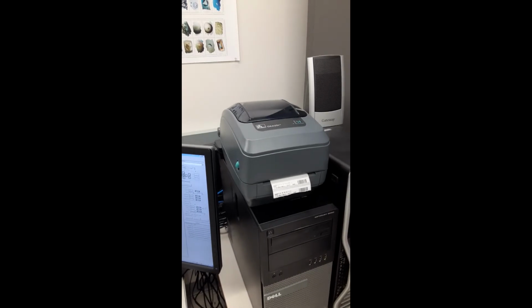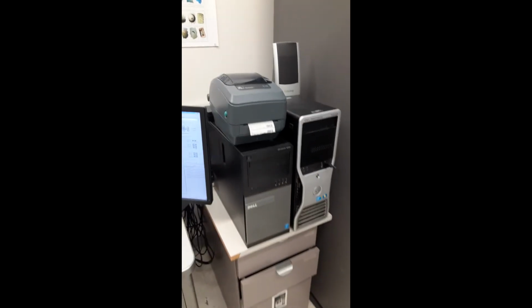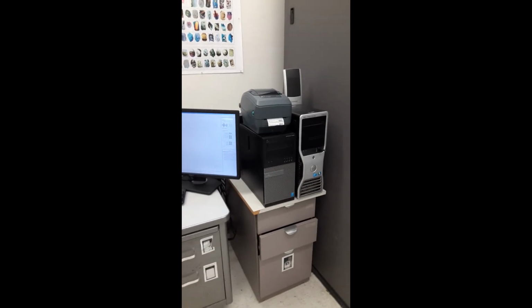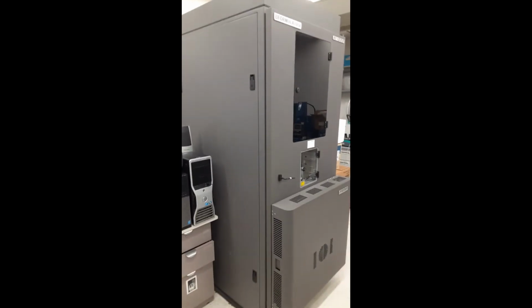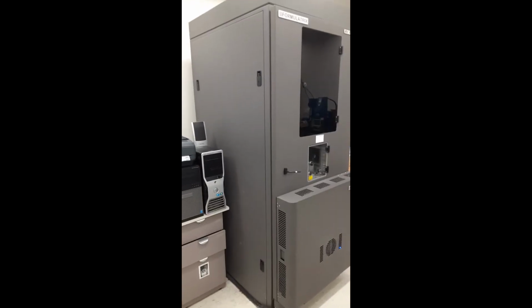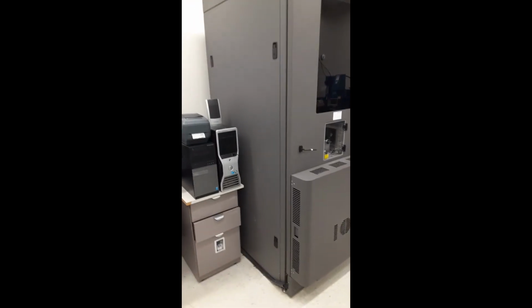It has a barcode printer. We print out a unique barcode for each plate. And in addition to these two computers, there is a storage server connected to this that has all the images stored on it and backed up, as well as a web serving server that has Rockmaker Web on it, so you can work with your images remotely.